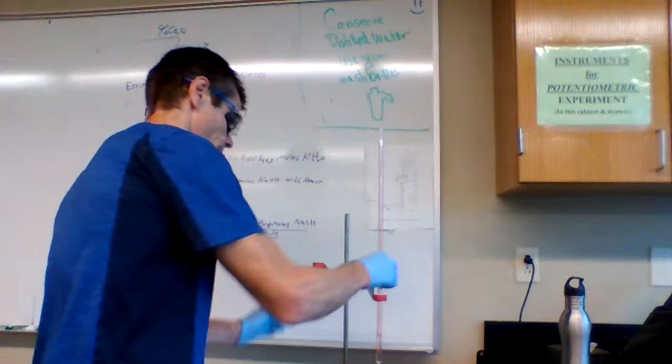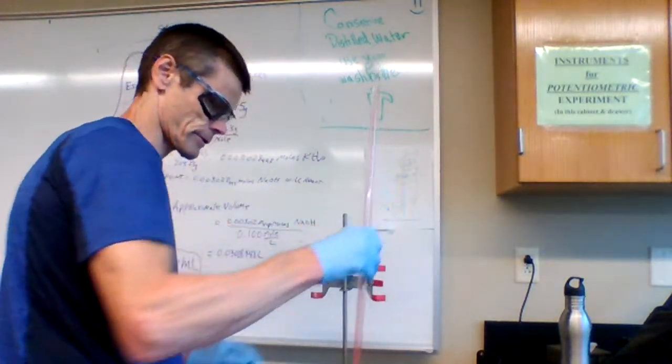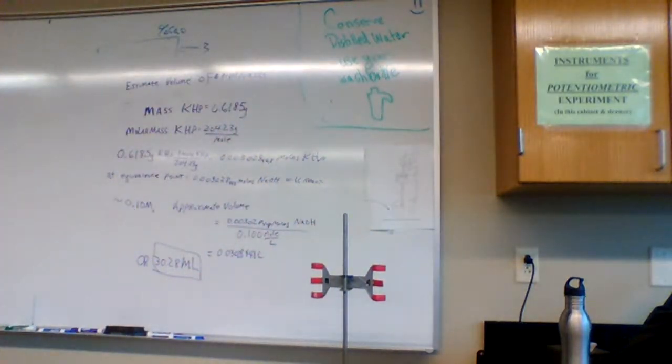Unfortunately, this one's not working. So that sort of sucks. Get a different one.